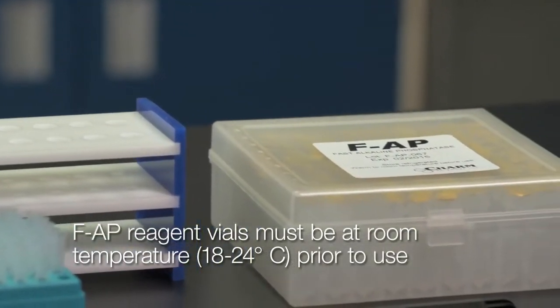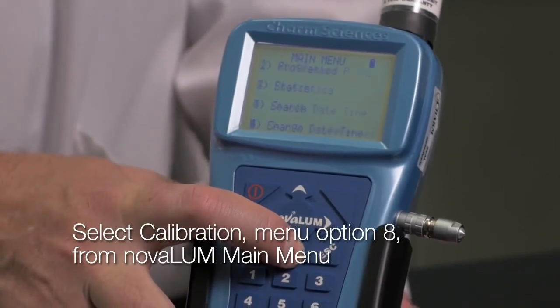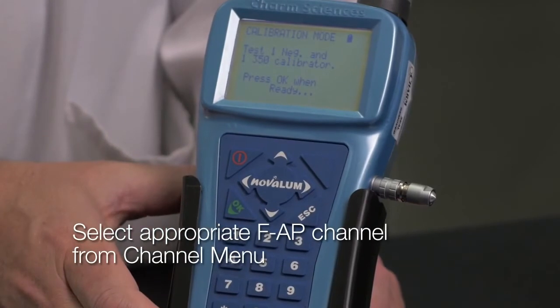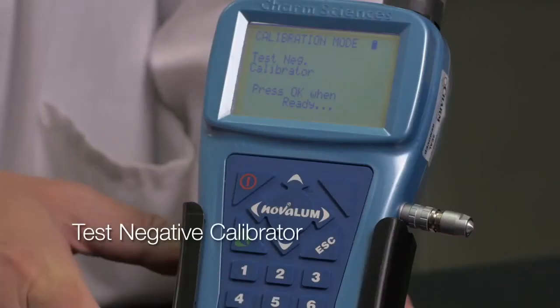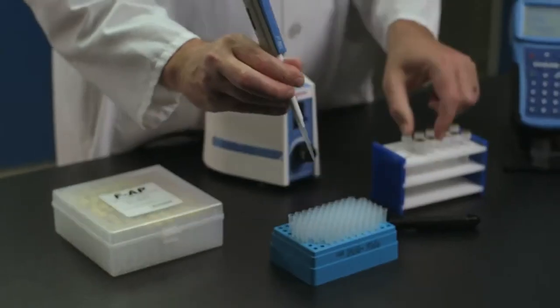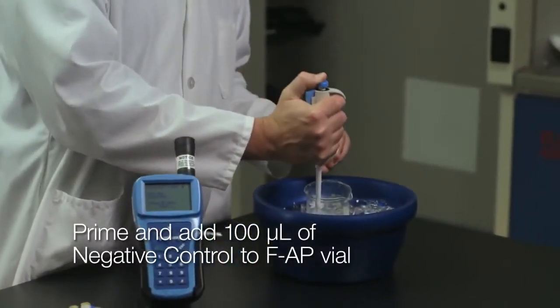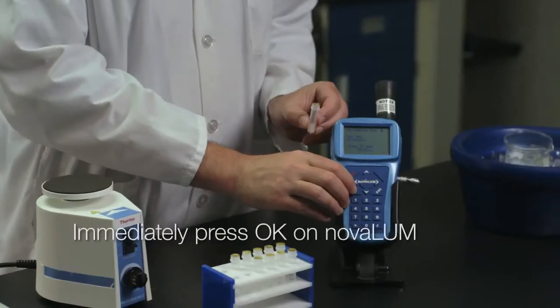FAP reagent vials need to be at room temperature prior to running tests. To calibrate the instrument, select calibration menu option number 8 from the Novolume main menu. In the calibration menu, select option number 3, FAP. In the channel menu, select your appropriate FAP channel — in this case, channel 4, FAP milk. The screen will prompt: test one negative and one 350 calibrator. Press OK when ready. You will test the negative calibrator first. Push the appropriate 100 microliter pipette tip onto your pipette, pierce the foil with a new clean pipette tip, prime and draw 100 microliters of negative control into the pipette tip. Inject milk into the FAP vial and immediately press OK on the Novolume.